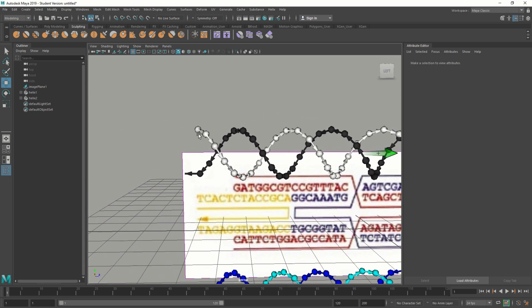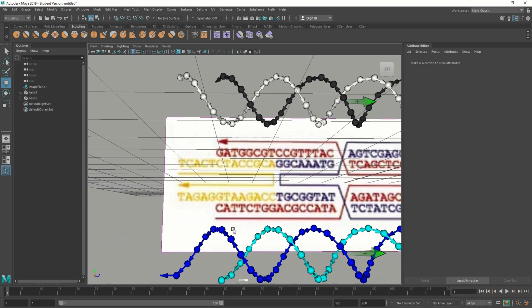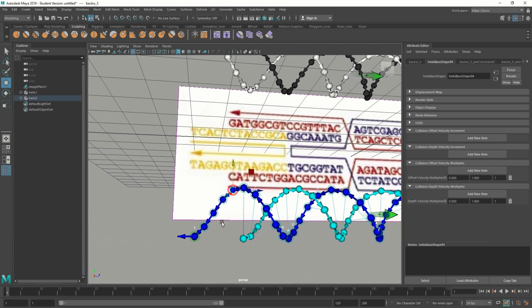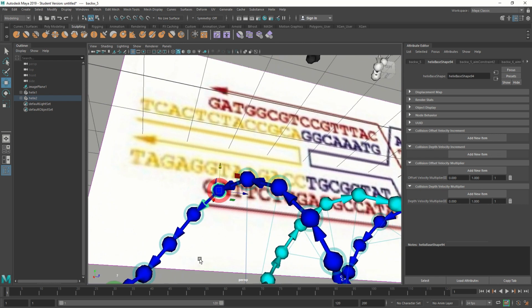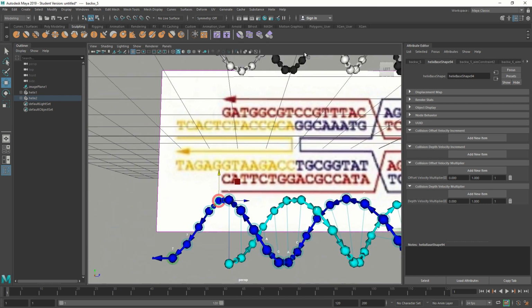And on this side, I'm going to trim off 5 nucleotides from the 3' end. So it's 1, 2, 3, 4, 5. And what's happened now is that there are some overhangs that never got a sequence, because it's not actually complementary to the main sequence that I applied before. So here we have 5 nucleotides that don't have a sequence, so we're just going to apply that now. That's this sequence here, and we're going to have to read it backwards.